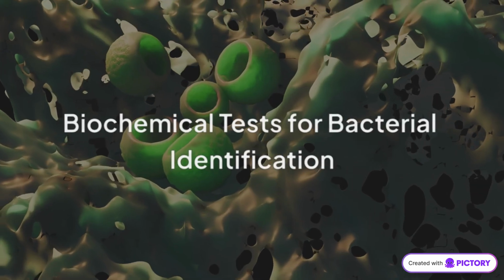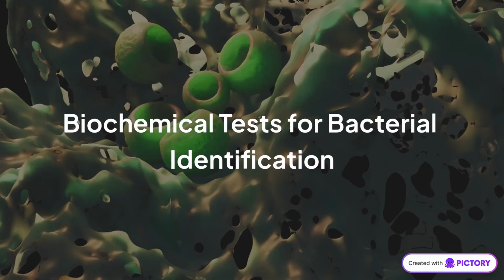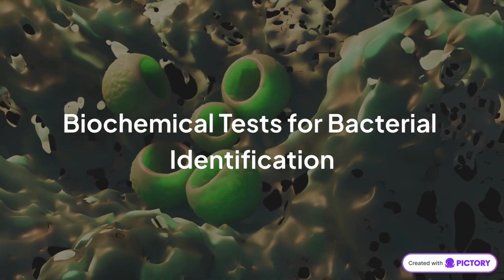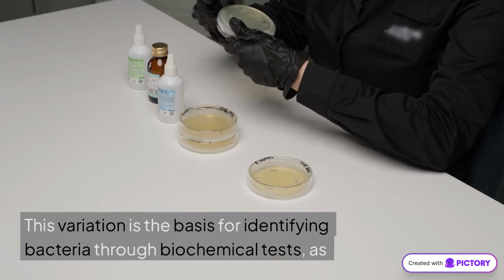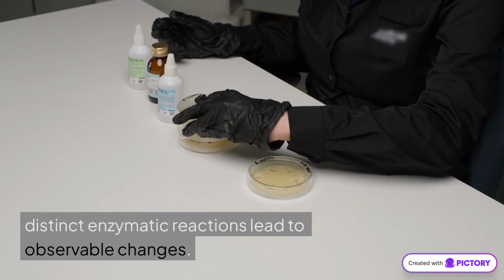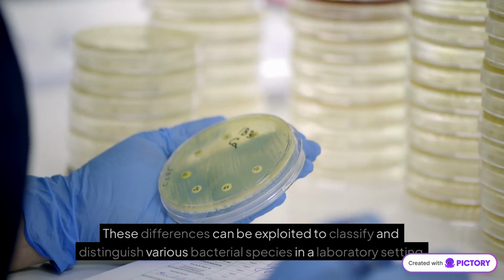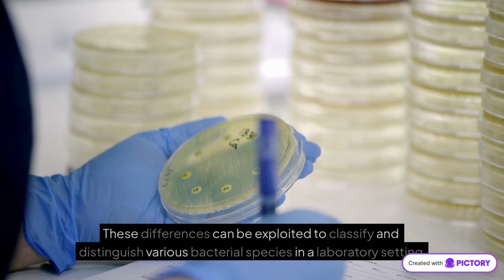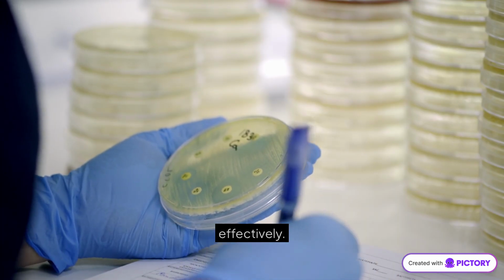Each bacterium contains a specific set of enzymes that allows it to perform unique biochemical functions. This variation is the basis for identifying bacteria through biochemical tests, as distinct enzymatic reactions lead to observable changes. These differences can be exploited to classify and distinguish various bacterial species in a laboratory setting effectively.